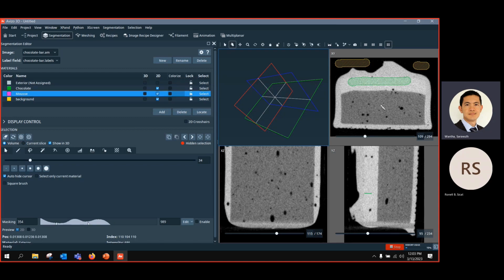And last one, mousse. So I just try to avoid the little dot. You can go, but just go on the same plane like this. And you can see this selected material in the gray material. And now we assign this to the pink mousse and click assign here. So yeah, now we have 3 materials, and you can see yellow for background, green for chocolate, and pink for mousse. And these 3 colors, we call them markers.